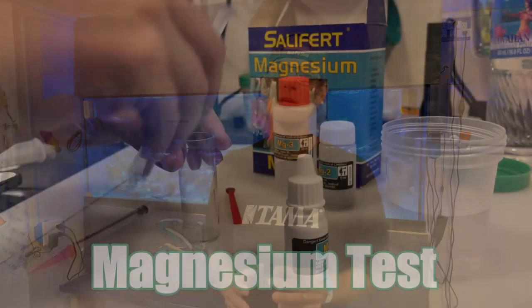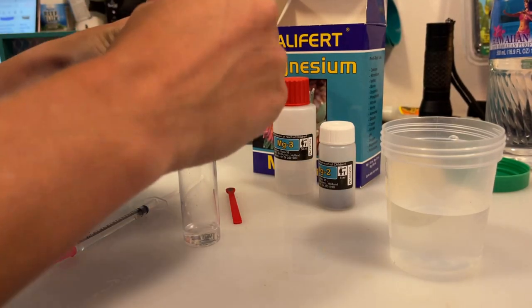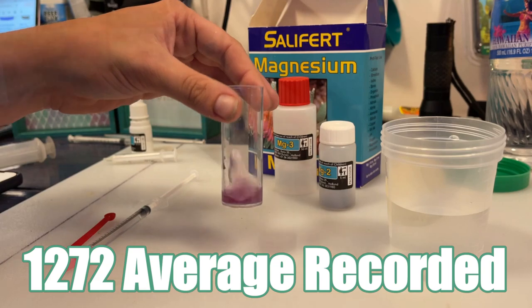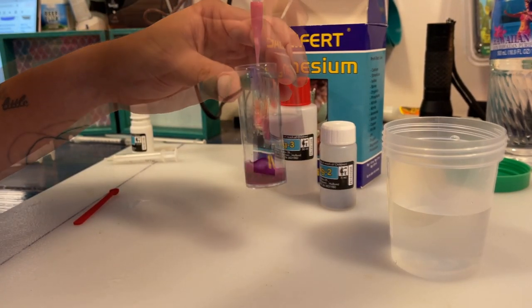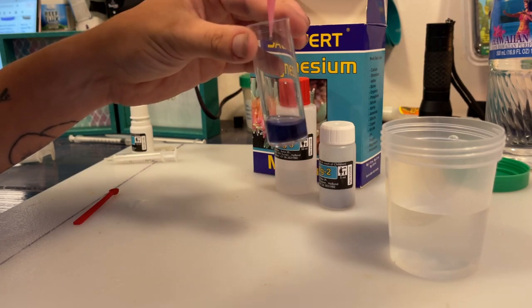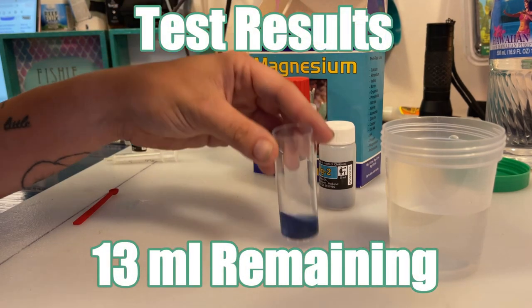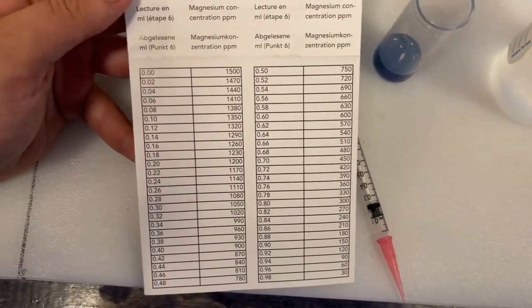Magnesium tends to be one of the abundant elements in seawater, and for some of us reefers, our tanks are no different. Research shows that 1272 is the average recorded amount of magnesium in the Pacific. By using the Salifert magnesium test kit, we will check our sample and see how they compare. We had 0.13 milliliters remaining in the syringe, which on the result card comes out to 1305, and as you can see, it's much higher than the average.